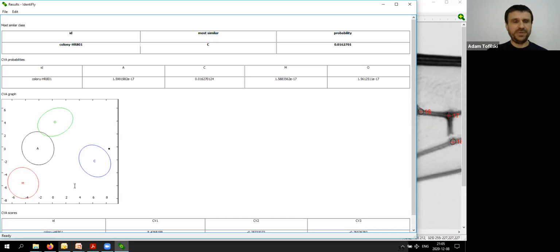In the case of bees from England, most colonies would probably be in this area. The more native ones would be inside the ellipse here, but some of them would be much closer to lineage C, or even in this direction if there is, like, Buckfast or similar. So if the point is intermediate between them, this would suggest it's more similar to others. In this case, it's on the other side. So it's safe, and it's easier to conclude that this is Carnica.